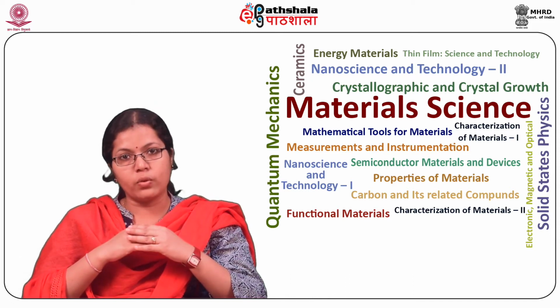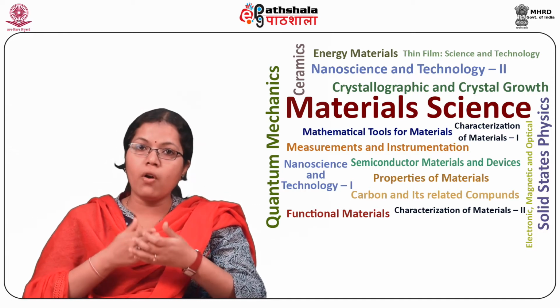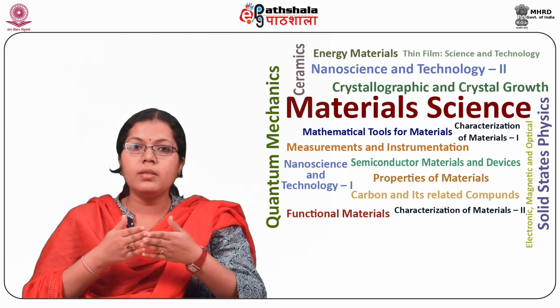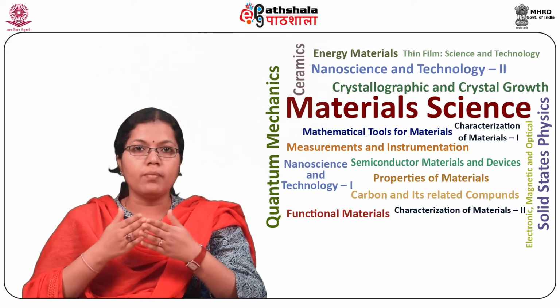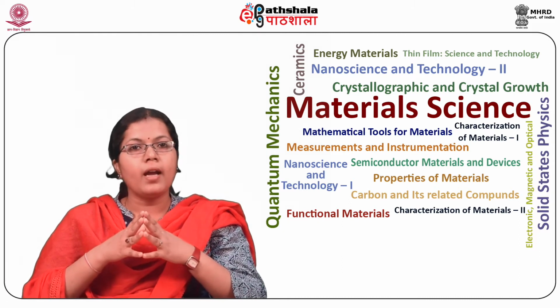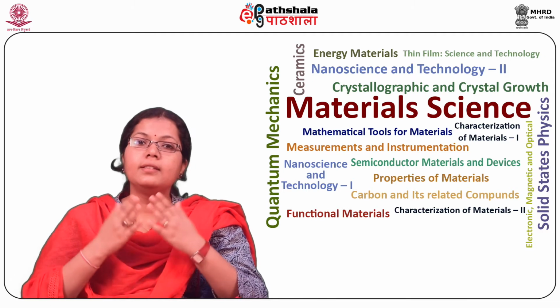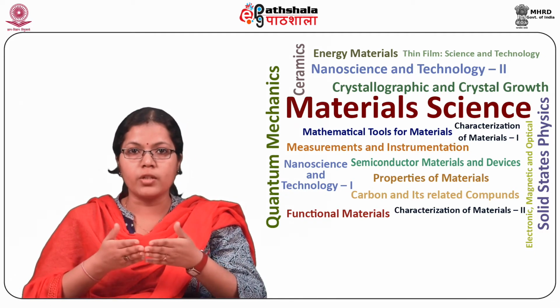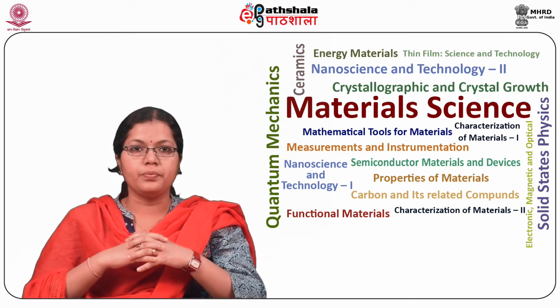Then the crystallography: arrangement of atoms and their degree of order, detection of equilibrium and metastable precipitates, orientation relationship. All this can be found out. And the third, that is the composition, that is the elements present in the sample and their local variation, and provide a high resolution image.